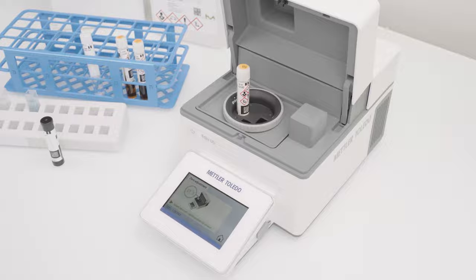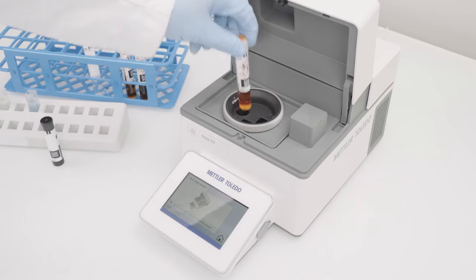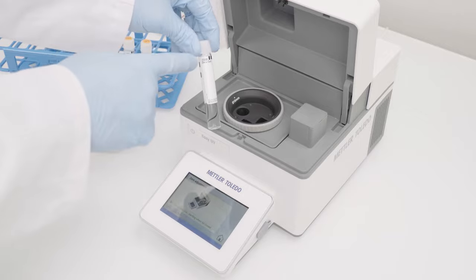If no zero adjustment is available, I am requested to insert a zero cell. I am replacing the sample tube with a zero cell and close the lid to start the measurement.